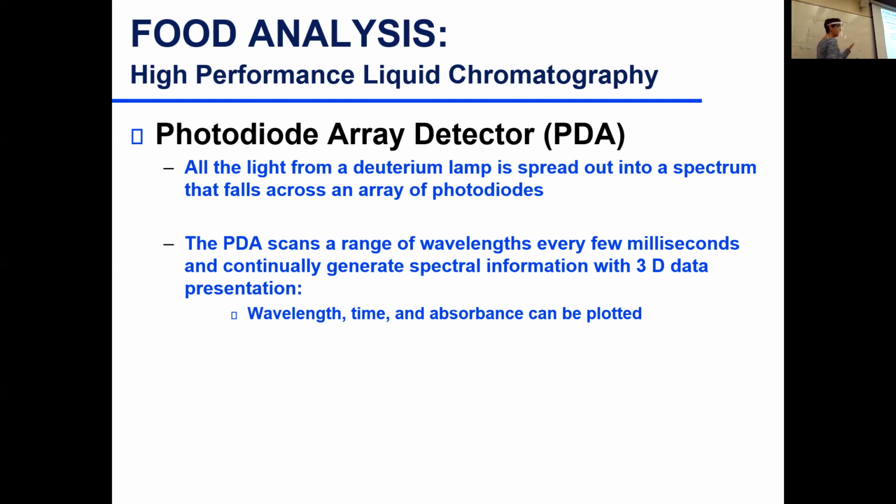This is what we saw in the lab. So your caffeine, let's assume this is at 16 minutes, this is your caffeine. In the chromatogram we picked lambda max to be 270, but the caffeine spectrum is a little different, it was 272. At 272 nanometers we got a peak, we get the area, and we use that for quantification.